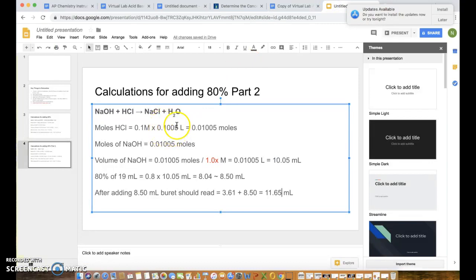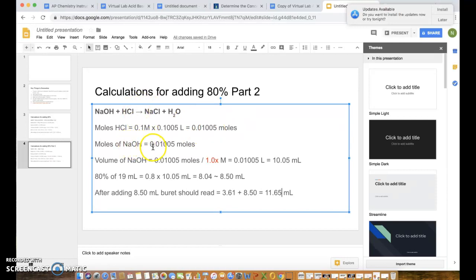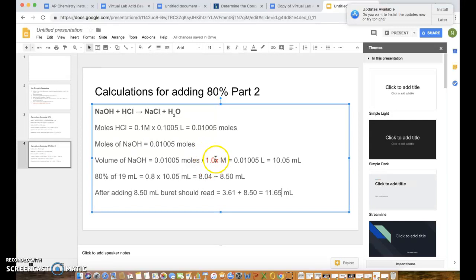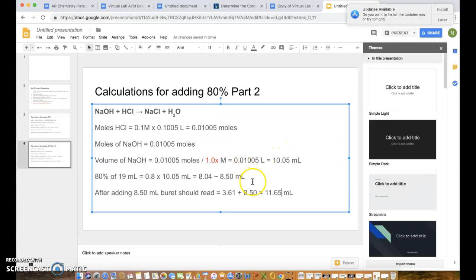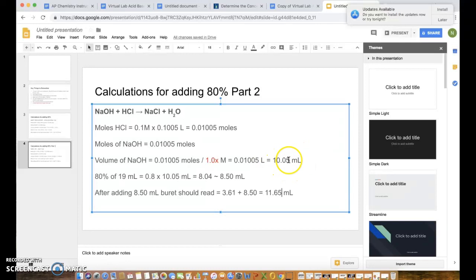So in order to figure out how much NaOH I need to add 80% of the amount for the equivalent point, this is what my work would look like. Same thing that we did before except in this case, since we didn't weigh out a solid here, we just have a solution. We're gonna use the 0.1 molarity and multiply it by its volume and the volume is written here at the bottom. You can see 100.50 milliliters, which if I divide that number by a thousand will give me the volume in liters. So I can multiply the molarity and the volume in liters and get the moles of HCl and that's what I did over here. So this is the volume in liters, this is the approximate molarity and that gives me the number of moles of HCl.